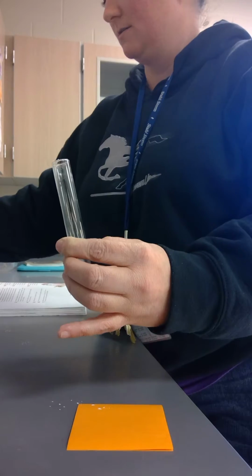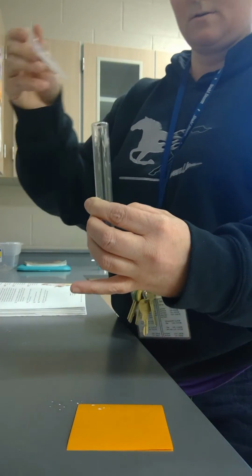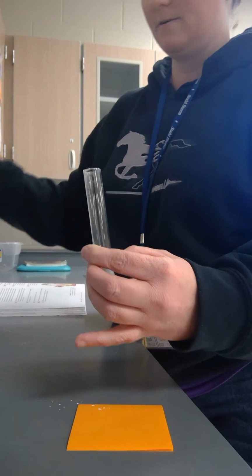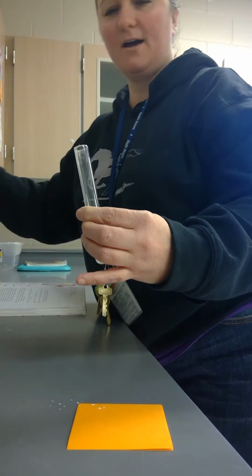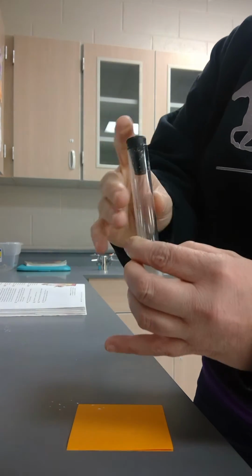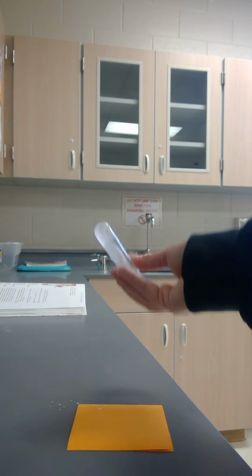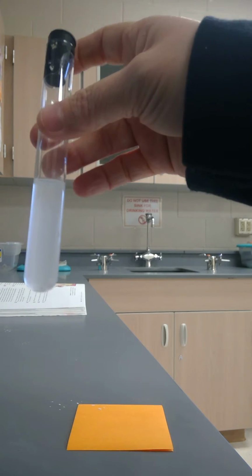And my water. Going all the way up to that 5 centimeter mark, almost there, a little bit more. Excellent. I'm gonna go ahead and I'm gonna cap it off. And I'm gonna mix it up, shake it up, 10 shakes. 1, 2, 3, 4, 5, 6, 7, 8, 9, 10. Take a look at that.